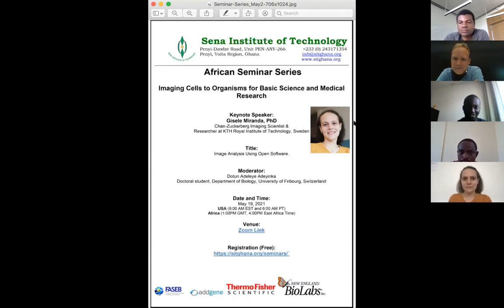The title of today's seminar will be Image Analysis using Open Software. And of course, we all know image analysis has been a fundamental part of biological research, which we cannot even do without. So in this seminar, we'll focus on the use of open software for image analysis, especially Fiji. Some people call it ImageJ, but it's still the same.